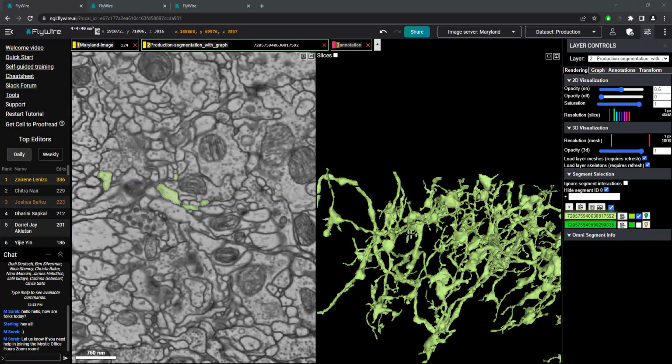All right, yay! So we have three actually pretty good questions slash problems to work with, and they all have to do with misalignments, which is probably half of the most common errors you're going to deal with that the AI couldn't handle. And we can go from there.